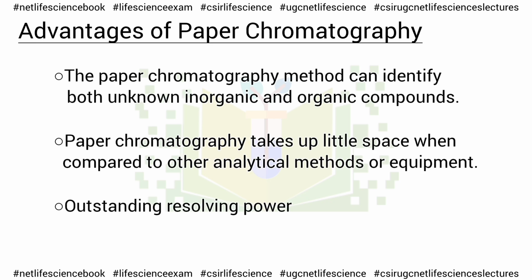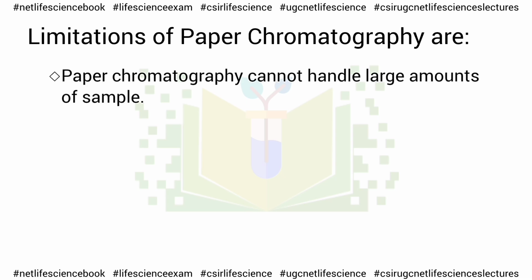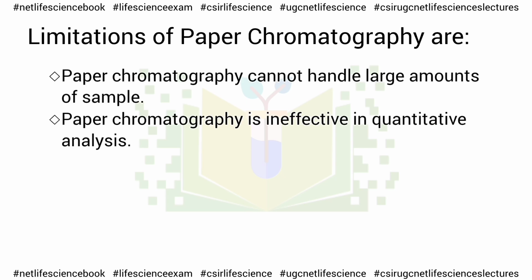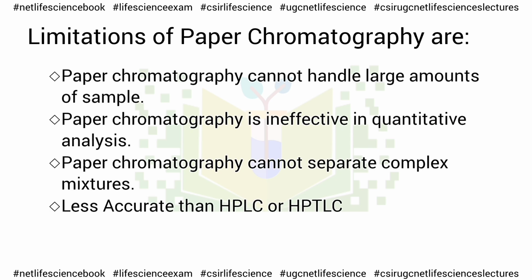Outstanding resolving power. Limitations of paper chromatography are: paper chromatography cannot handle large amounts of sample. Paper chromatography is ineffective in quantitative analysis. Paper chromatography cannot separate complex mixtures. Less accurate than HPLC or HPTLC.